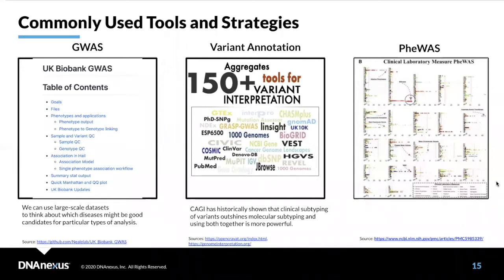There are lots and lots of tools and databases for variant interpretation. What I use personally most often is OpenCravat. You can check that out at opencravat.org. Obviously, SNP, SIFT, ANNOVAR, and then some of these individual databases and tools like ClinVar and gnomAD and VEP are clearly very popular, and that's awesome. But I think it's really important to get a biological understanding of what you're looking at so you can tell really what is the noise that's coming out of these other algorithms.